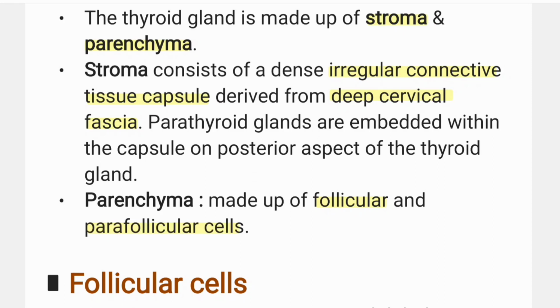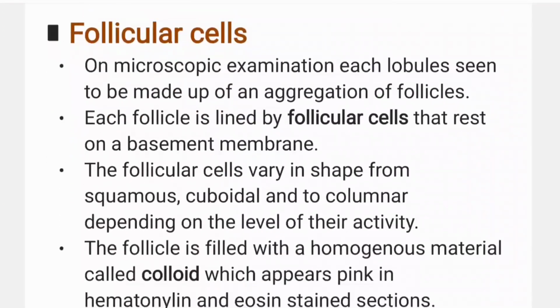So now we'll look at these parafollicular and follicular cells individually. So first of all, the follicular cells. On microscopic examination of each lobule, we can see that they are made up of aggregation of follicles. Now each follicle is lined by the follicular cells that rest on a basement membrane.